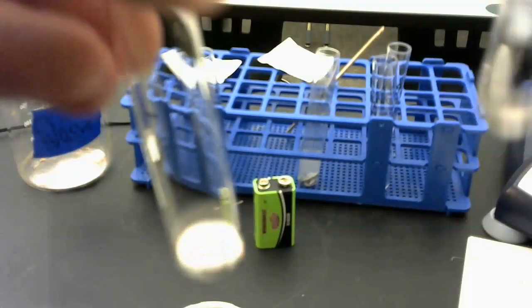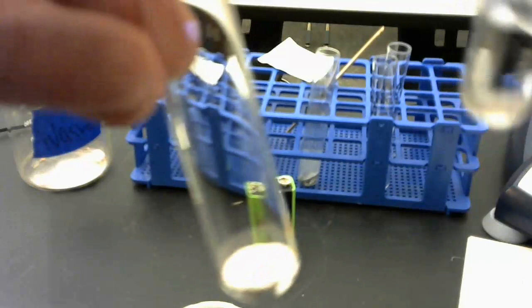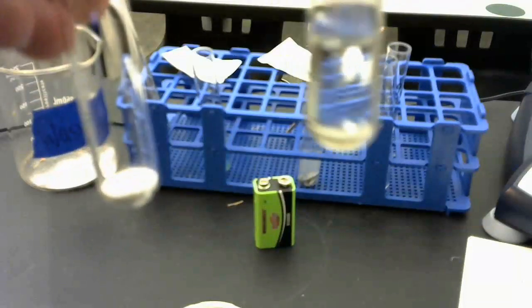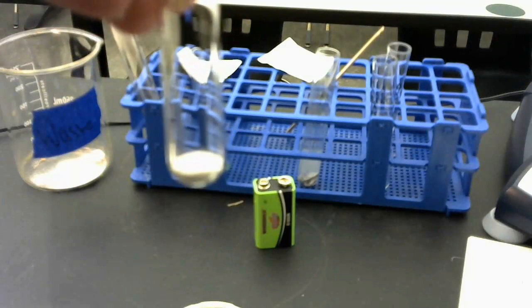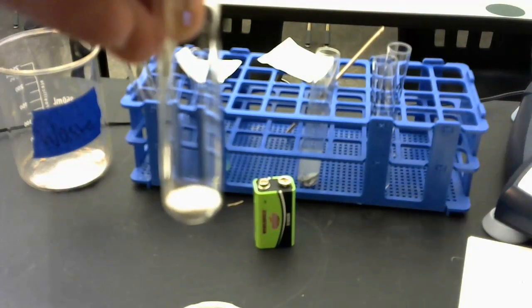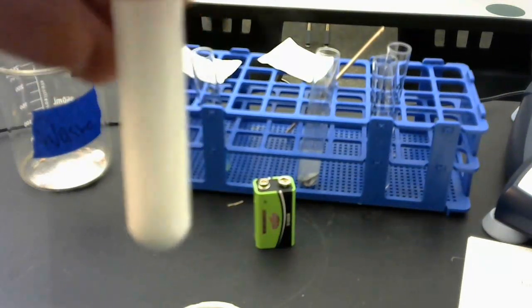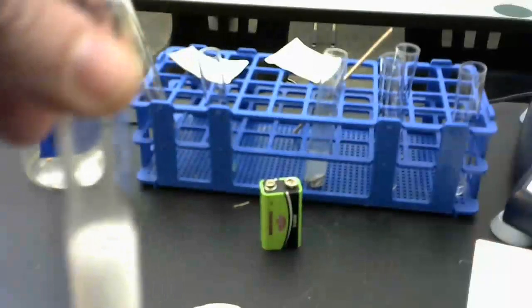And then it says after I add that, while the reaction is occurring, test with a flaming splint as done in station 3 and check out your reaction. So I have sodium carbonate and I have hydrochloric acid, and I'm going to add the two together and watch carefully at the bottom of that test tube. Okay, so I definitely had some kind of gas released.